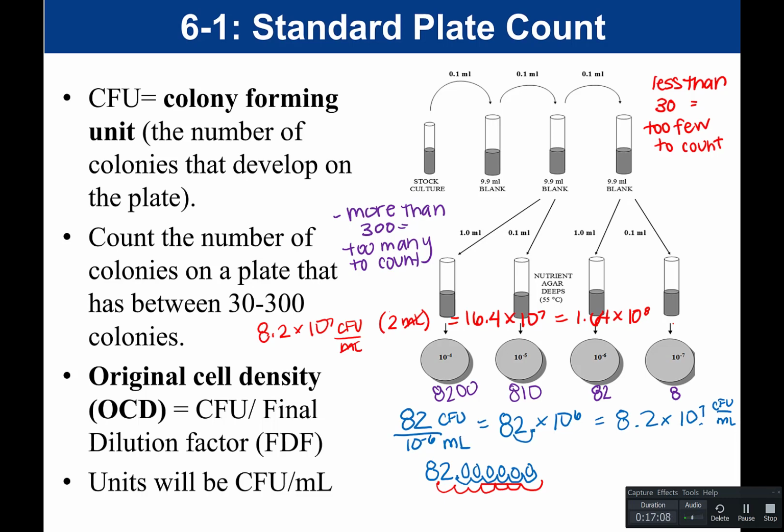That would be the total number of microorganisms in the stock if there were 2 milliliters when we began. So our titer is the number of bacteria per milliliter. If we want to determine our total number of microorganisms, we need to take our titer times the number of milliliters. That is going to tell us the total number of microbes that was in that stock solution. And so this is how you're going to do your calculations.